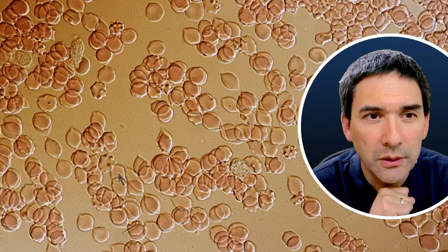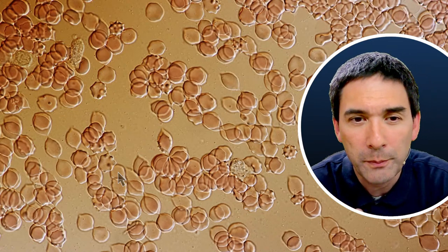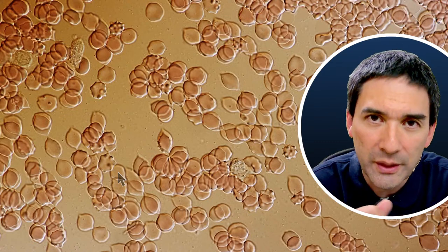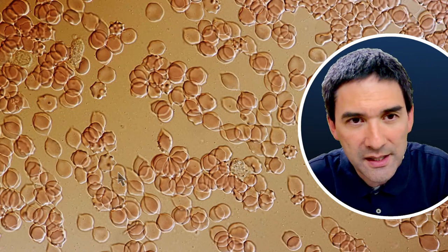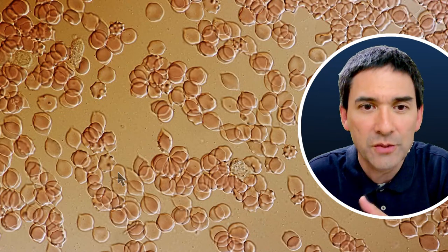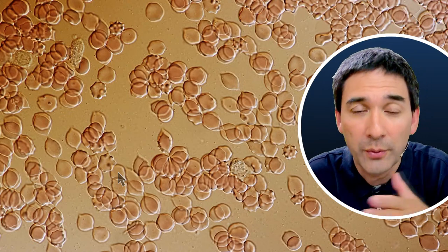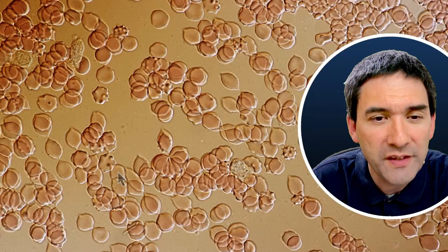Indeed, when you look at simply a blood sample under the microscope, because the white blood cells move kind of slowly, you also do not always see them quite easily. But in the time lapse, you're able to see that as the water, the blood plasma, evaporates and the blood starts to spread, the white blood cells might move in a different direction than the red blood cells, which are swept away with a general flow. So this is kind of the thing. It's a question of visibility, I would say.